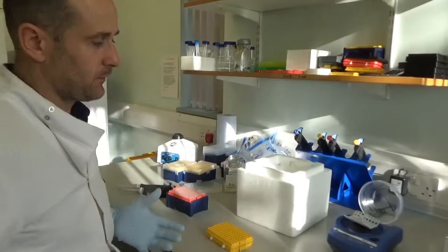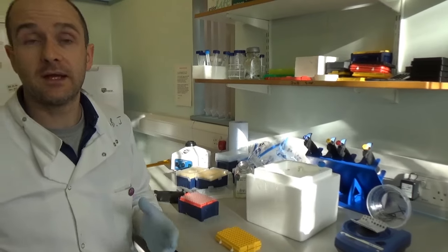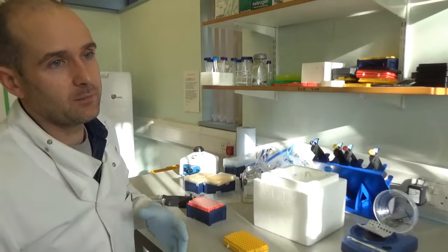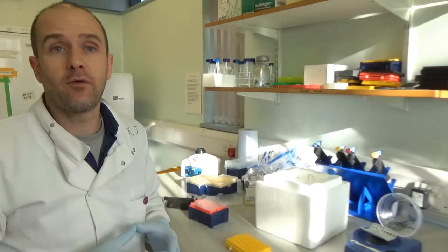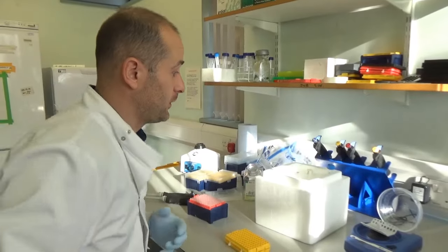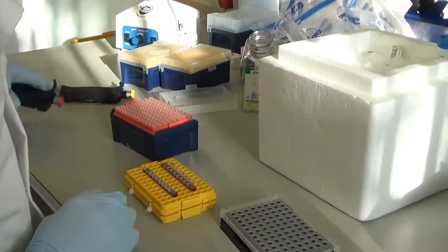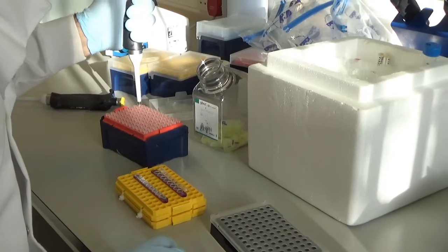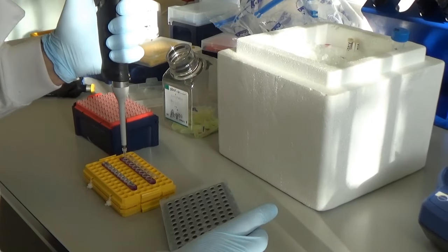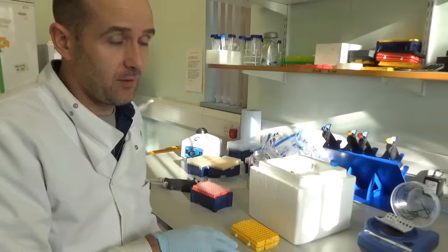Okay, at the moment what I'm doing is I'm looking at how different genes are expressed in a particular disease state. What we want to do is be able to stratify disease to better inform treatment for different diseases. So we use a technique called quantitative polymerase chain reaction. So I have samples from a disease model, and then I use this PCR reaction to amplify the genes and quantify them. So this particular model I'm interested in is a model of arthritis.